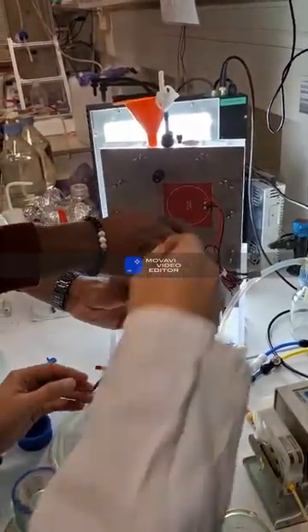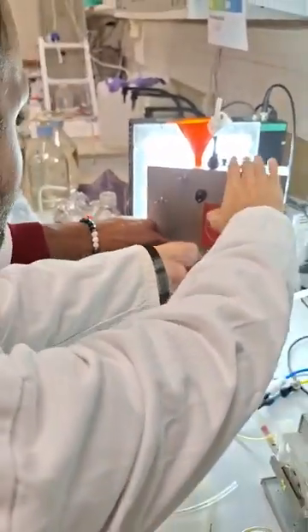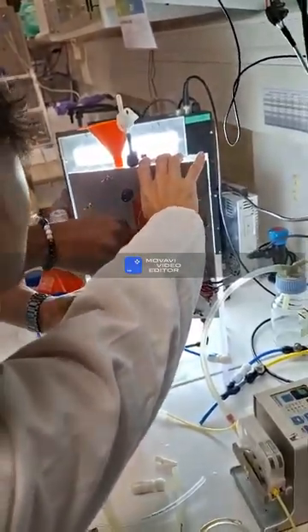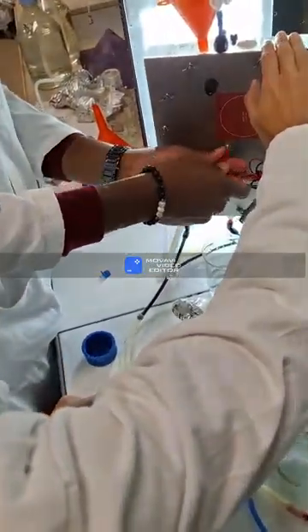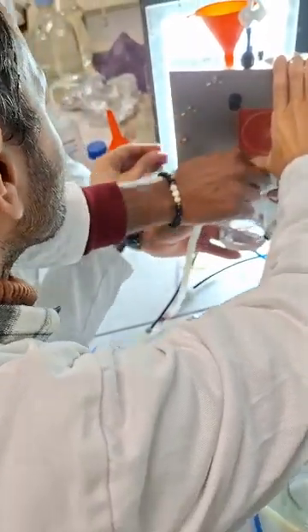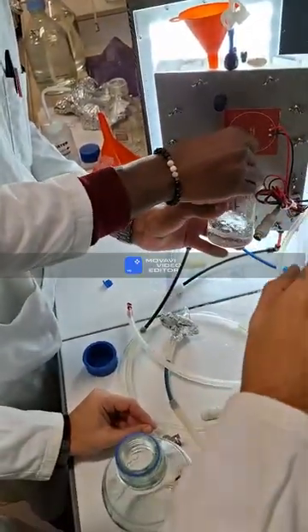Can you unplug this? No, you just need to push this ring, the gray ring. Not this, that one. You see the gray ring? Just push it, and that's it. Yeah, perfect. Thank you.